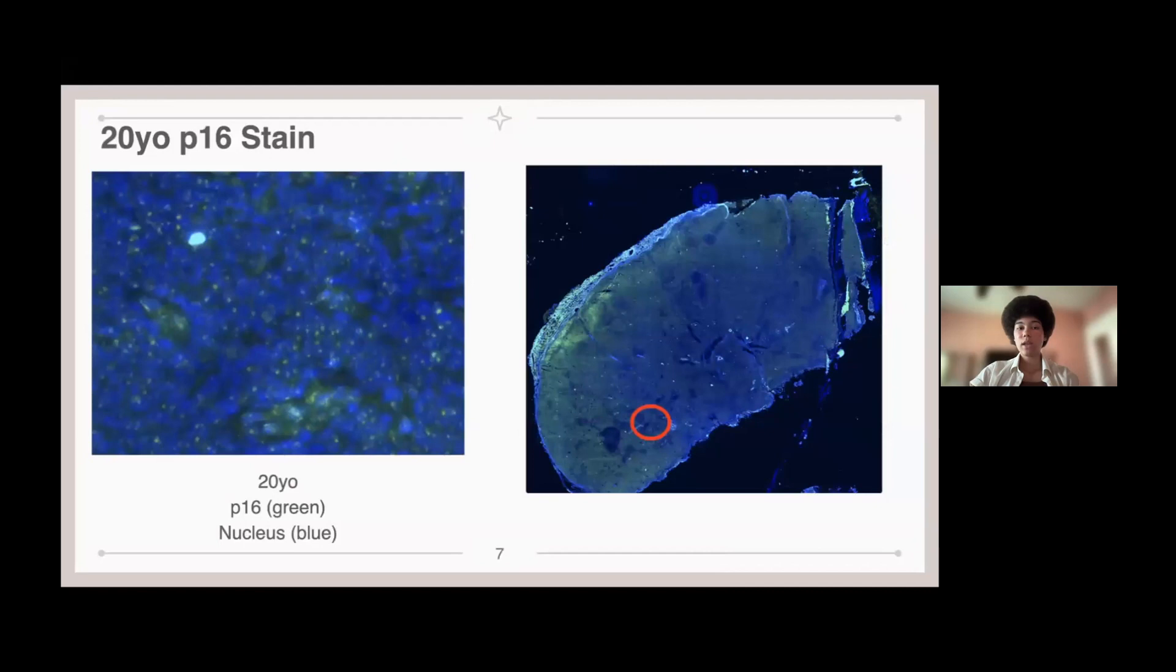And then this was the actual staining for the P16 on the 20-year-old. The P16 is in green, and then the nucleus is in blue. Tissues are naturally autofluorescent and emit green light. So a lot of this is actually so-called background. What we actually are looking for is the P16 within the nucleus.